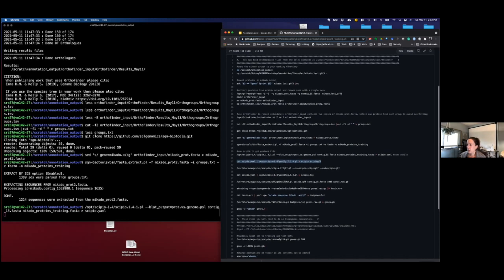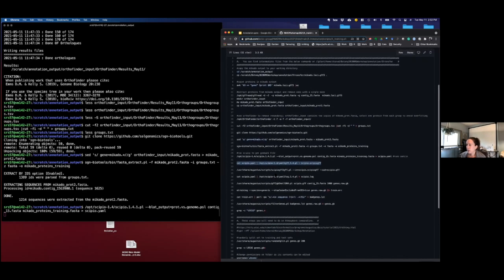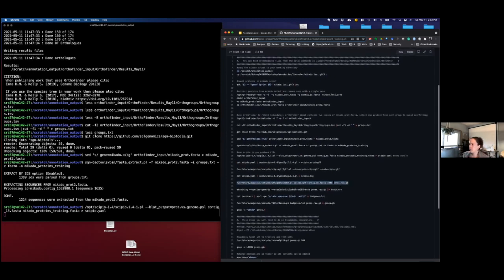First it generates a GFF file. Then it does some things to, here is the part I'm talking about. Here's where you actually end up with some GenBank formatted gene models. The reason you have to do this is because Augustus wants things in GenBank format, which I don't really use that often, but I know is another popular format for these types of things. So you need to basically figure out how your proteins are arranged on the genome and then get that into GenBank format. This is getting back to bioinformatics being about moving a lot of file formats around.